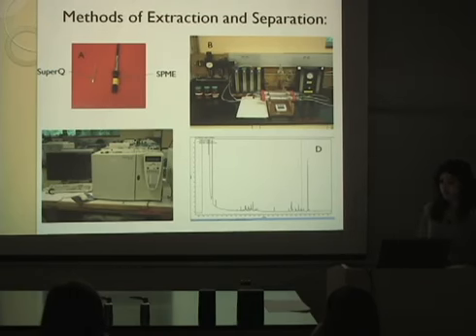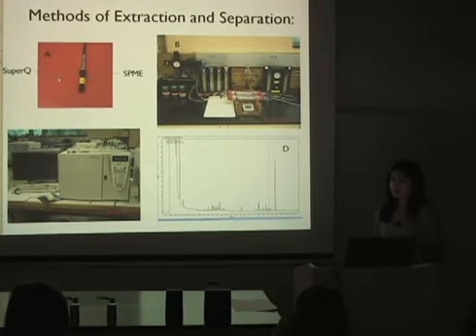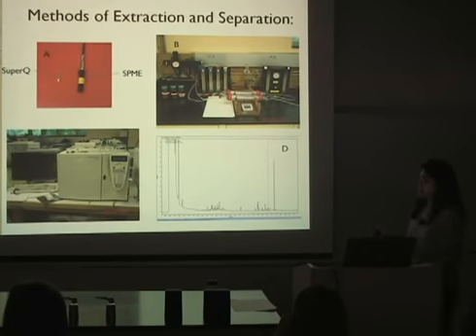So the volatile collection technique consists of glass chambers in which the sample is placed, and this is a push and pull system because air is pushed by a source of purified air through the glass chambers where the sample is placed, and as the air passes through the chambers, it carries with it the volatile chemicals that are in the sample, and then as air is being pulled out by the vacuum system, the components of the sample are collected on the Super Q filters that are attached on this end.